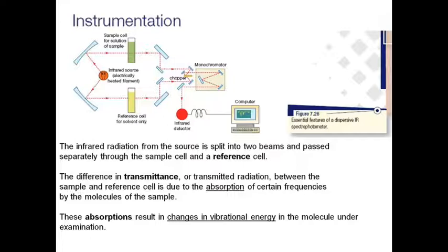That chopping unit allows the infrared detector and the computer to continuously compare the sample to the reference cell.